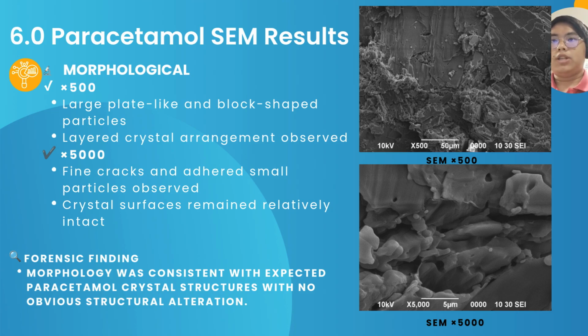The SEM image of paracetamol showed plate-like particles with a layered crystal arrangement. At higher magnification, fine cracks and small adhered particles become visible. However, the crystal surface remained relatively intact. The absence of abnormal structural features suggests that the sample maintained its expected morphology without obvious physical changes.